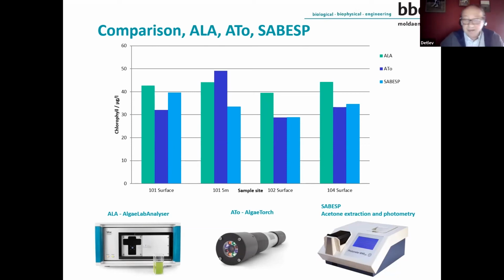So I think one can imagine that this way to perform chlorophyll analysis may more and more replace the classical spectrophotometric attempt. We see this, for example, in China, where they try to convert to fluorometry, which is not only a cheaper way to determine, but it is less laborious and does not consume organic solvents, for example.